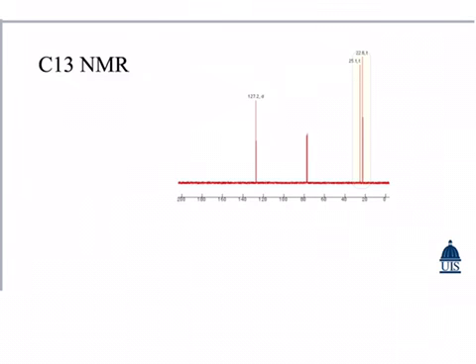Now that we have a structure in mind of a 6-member ring with a double bond between carbon and carbon, we can now analyze carbon 13 NMR. We're going to add the hydrogens to our structure and compare all the different carbon environments that the structure has. When looking at the carbon 13 image, we identified 3 carbon environments, 1, 2, and 3.